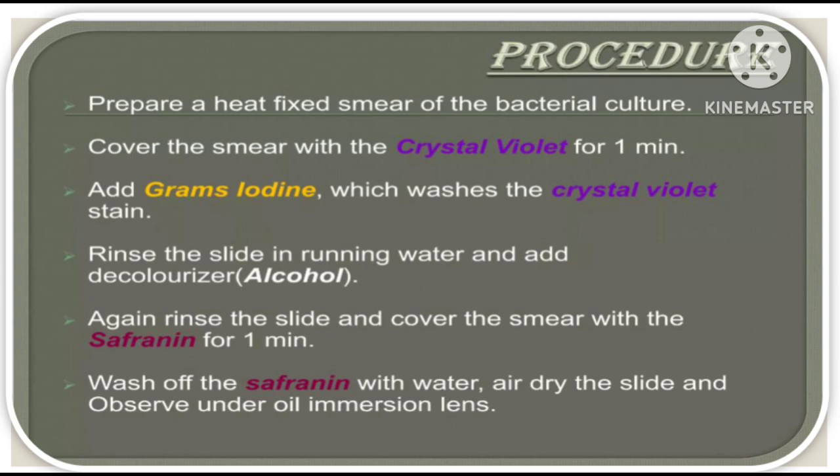Wash off the safranin with water. Air dry the slide and observe under the oil immersion lens.